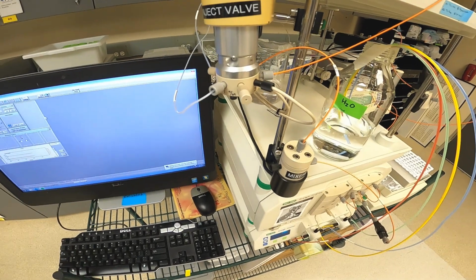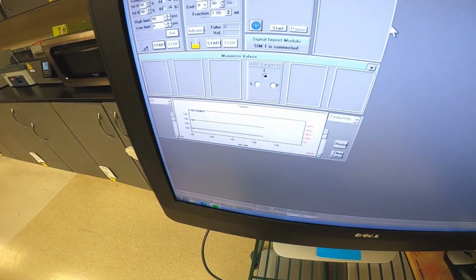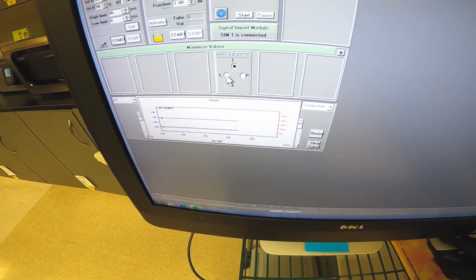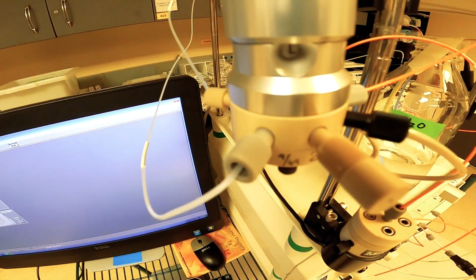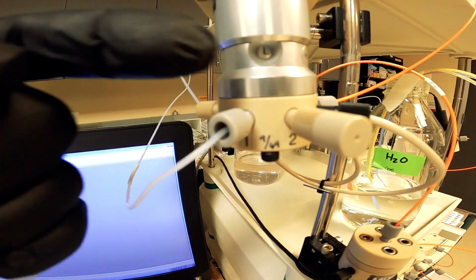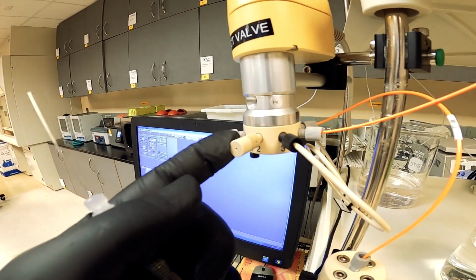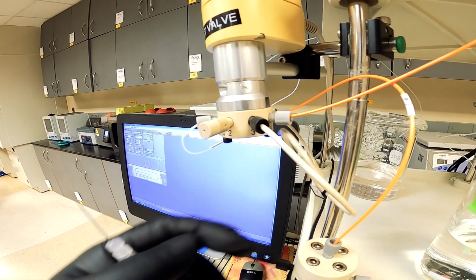The first thing we want to do is go to our software, and in the manual mode, which we're in, just make sure that our injection valve is set to the load position. Again, we can confirm that we are in fact in load position by looking at our little window. Sample will go in through this port and out through this port, which is where our loop is located.